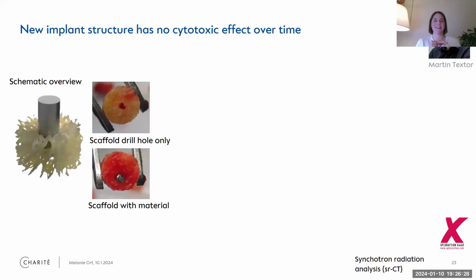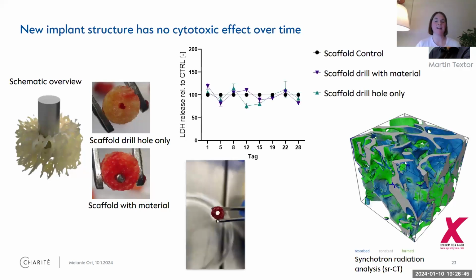And I just want to say that all of those things, no company is helping you with these kinds of things. So Martin had to be super creative about how to drill a tiny hole into a tiny bony piece and then insert this tiny new material into it. But he did that and he monitored LDH again, so the cytotoxicity.